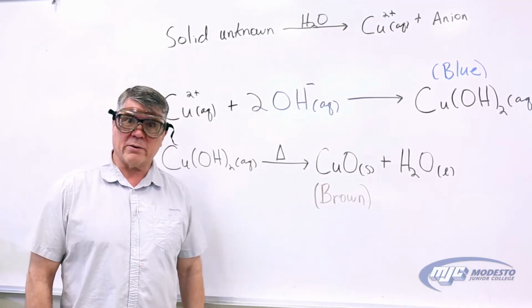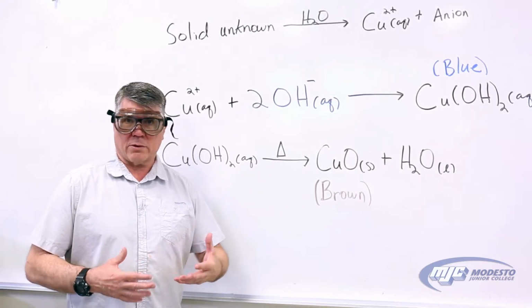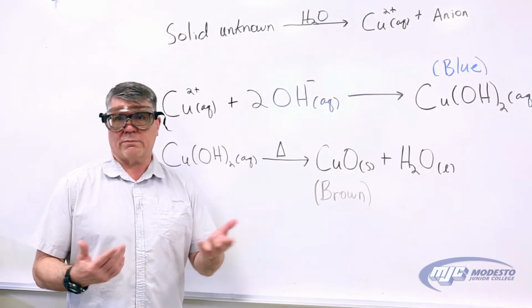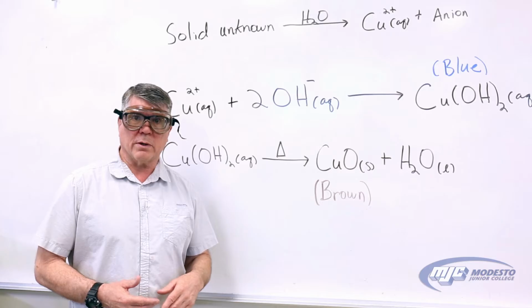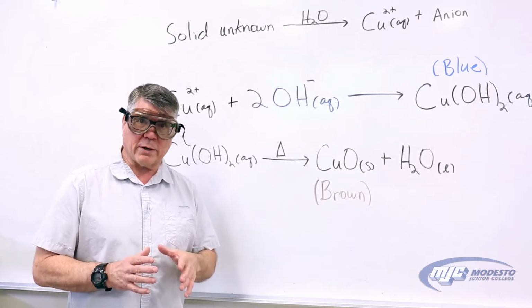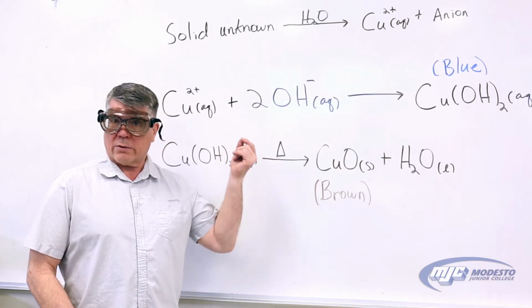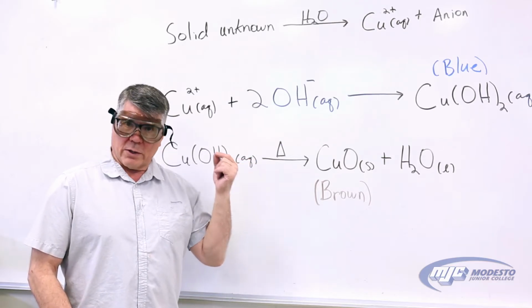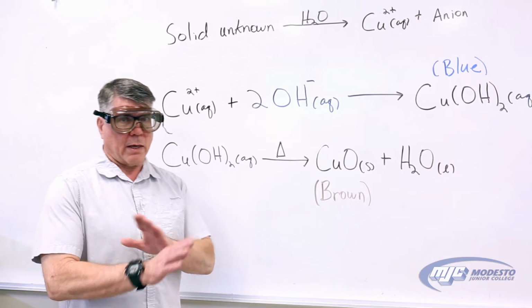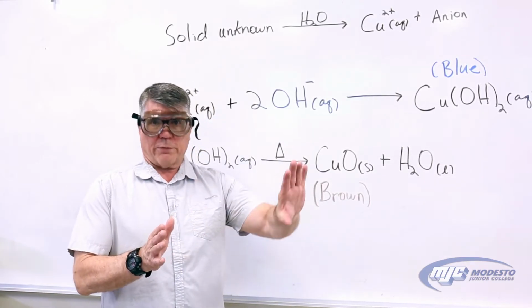Welcome to Gravimetric Analysis. In this experiment, the idea is you're going to analyze two unknowns. We have two unknowns, one solid and one a solution, but you're going to figure out how much stuff is in there. In the first unknown, part A, the unknown is a solid, and the solid unknown is an ionic compound. For all of them, the cation is the copper two ion, with different anions.